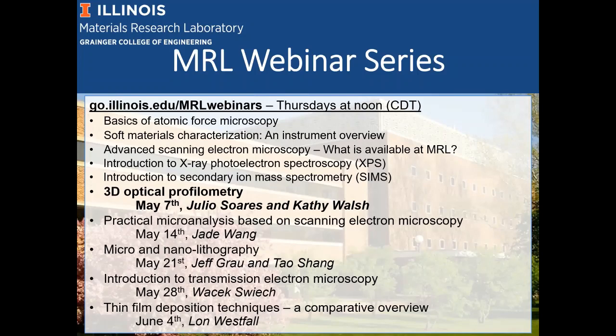This is a list of some of the recent seminars we've had and upcoming seminars. I'd like to point out we have some seminars on SEM and lithography in the next couple of weeks, followed up by some TEM and thin film deposition techniques.